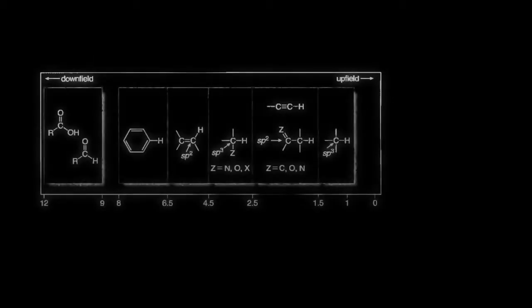The chemical shift table can be used to correlate chemical shifts with possible structural environments. The figure indicates the chemical shifts of protons. It is important not to confuse these with the peak of the solvent used to dissolve the sample. Deuterated chloroform is used as a solvent for the sample. The deuterated chloroform solvent is only 99%, and the 1% of regular chloroform will give a peak at 7.2 ppm.